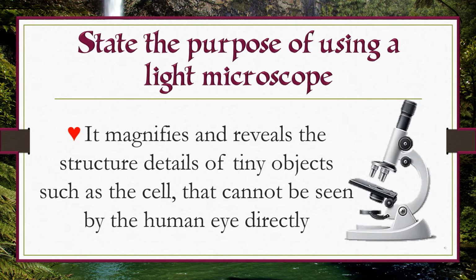It magnifies and reveals the structure details of tiny objects, such as the cell, that cannot be seen by the human eye directly.